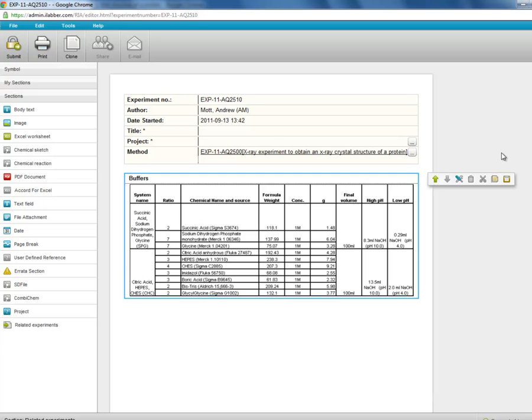And this was an Excel file. So now there is a new Excel file in an exact copy in this new experiment.